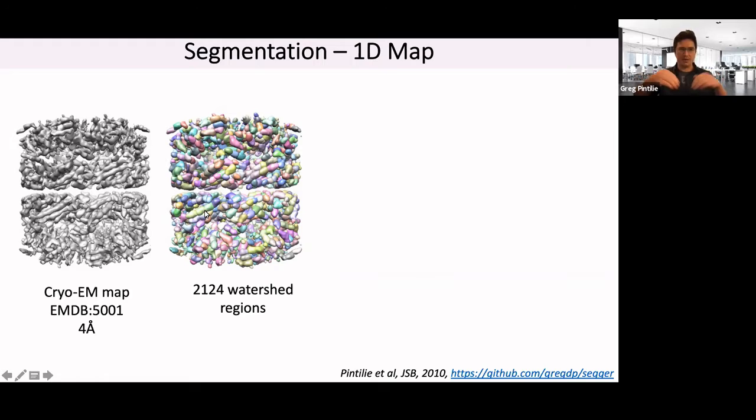That means that in the map, that lowest value is such that they connect, or on some sides, the blobs might not actually be adjacent to anything. This has to do with the threshold that is applied. When we visualize the map, we have this notion of a threshold, so we only show the density values that are higher than that given threshold.